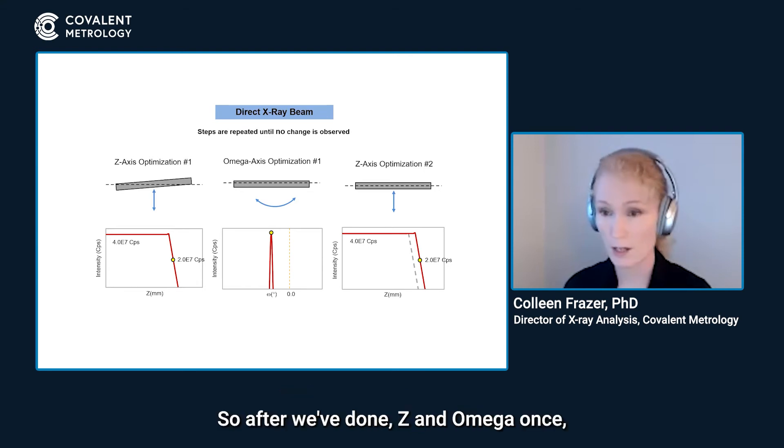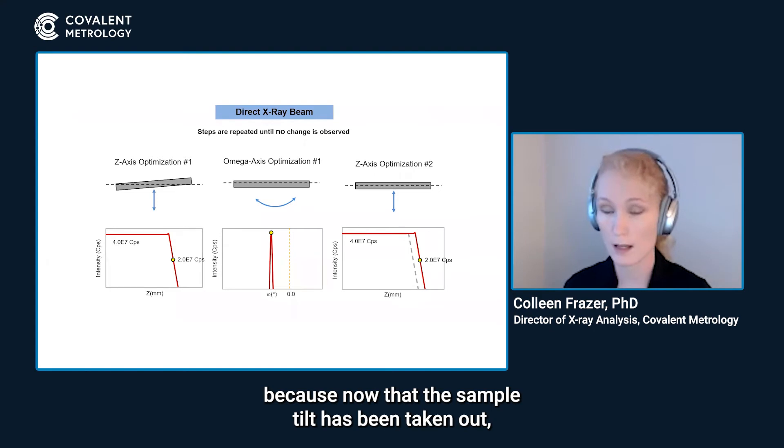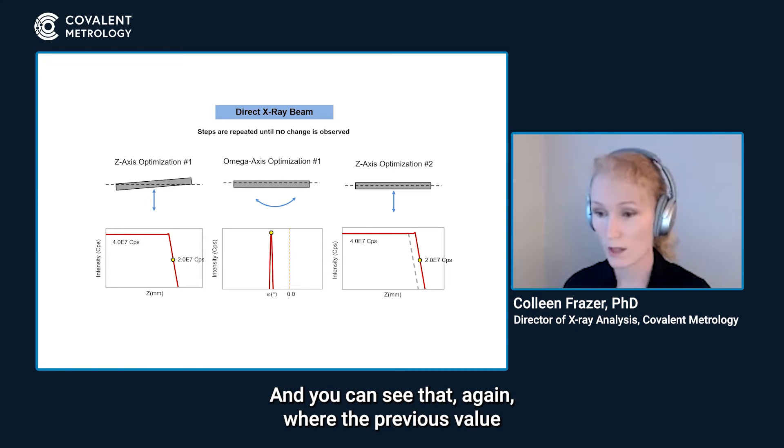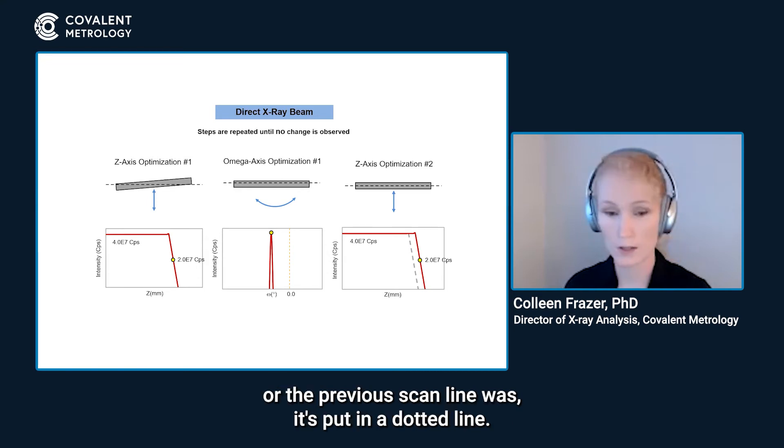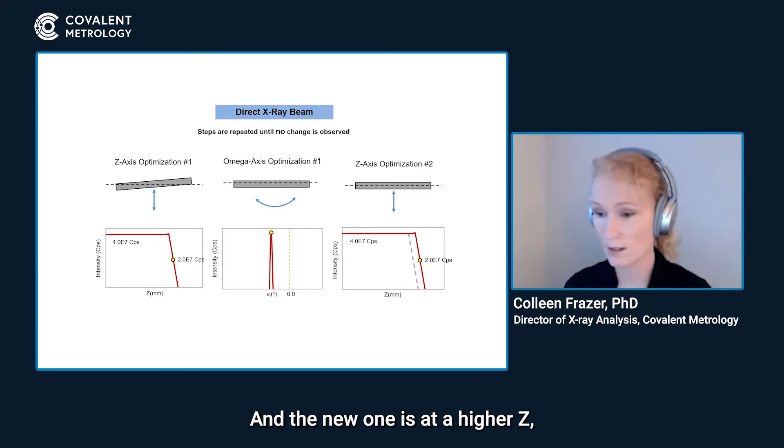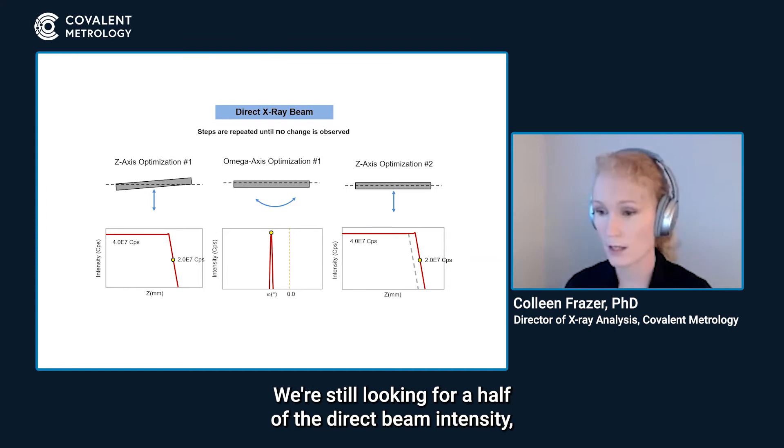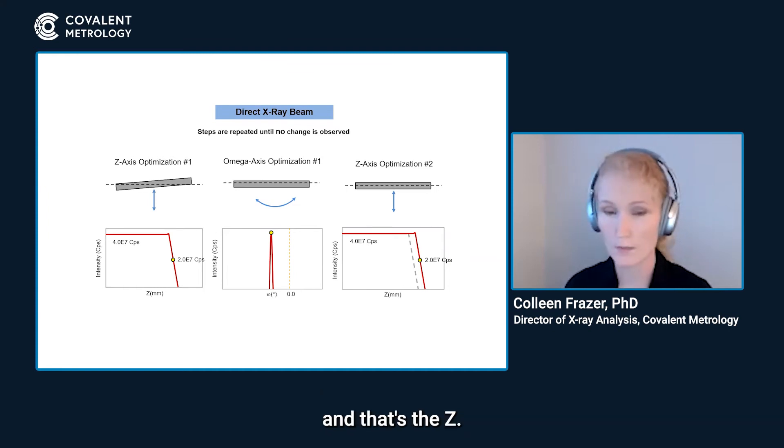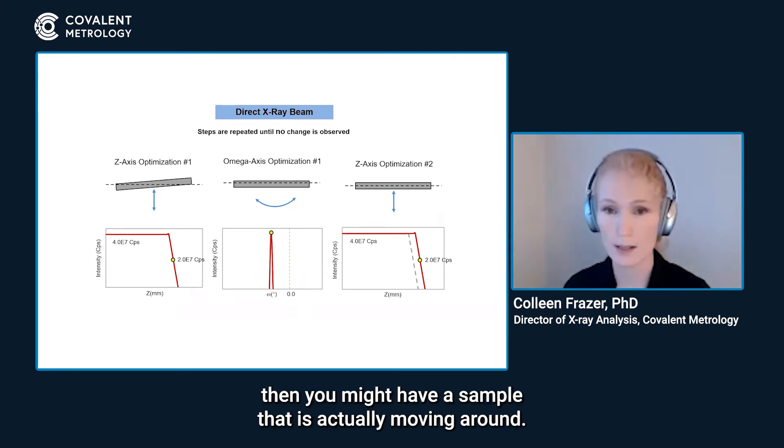So after we've done Z and omega once, we're going to return to Z because now that the sample tilt has been taken out, the Z value will change and you can see that again where the previous scan line is put in a dotted line and the new one is at a higher Z because the sample is no longer tilted. We're still looking for half of the direct beam intensity and that's the Z. So it's not uncommon to have say three Z iterations and at least two omega iterations. Shouldn't take more than five minutes total and again if they're not converging then you might have a sample that is actually moving around.